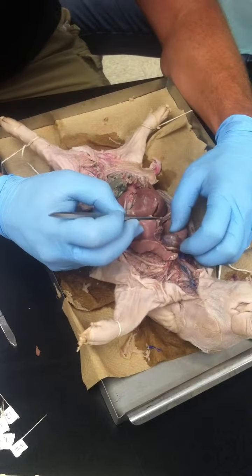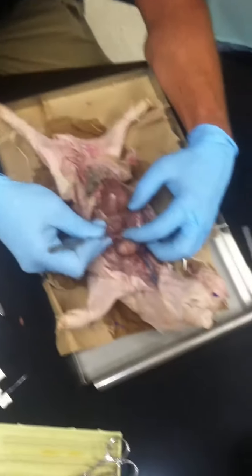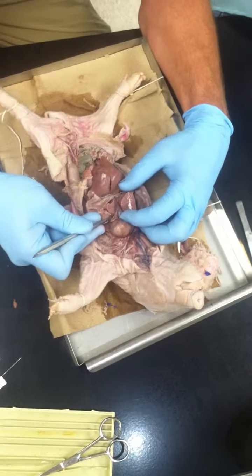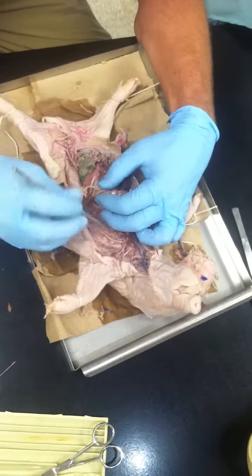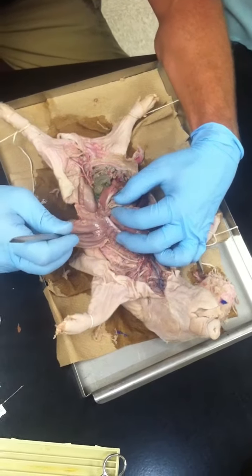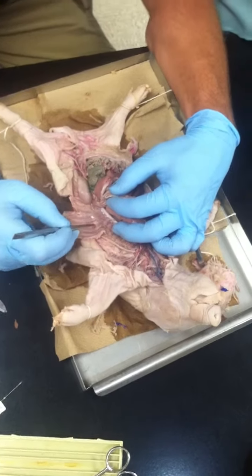Inferior vena cava. See that right there. Inferior vena cava. Internal intercostals, or intercostal artery and vein. In between the ribs.